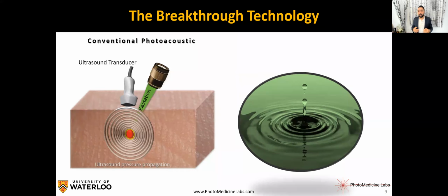So if we basically replace that stone with our excitation laser, the waves we are generating are sound, or photoacoustic signals. And there are two ways for us.